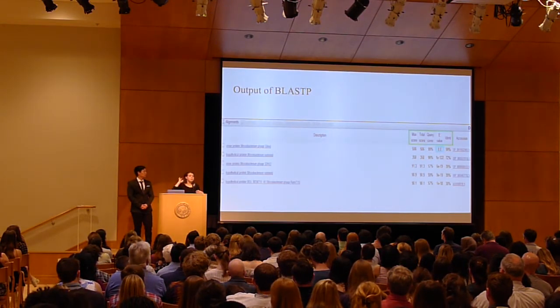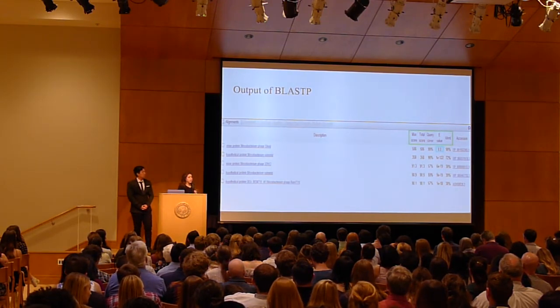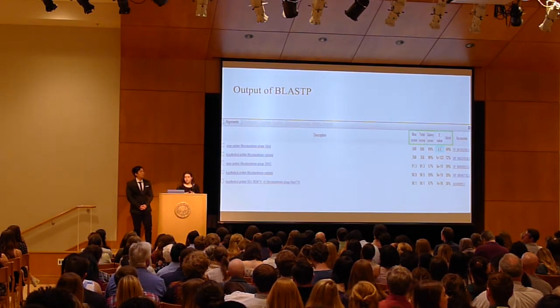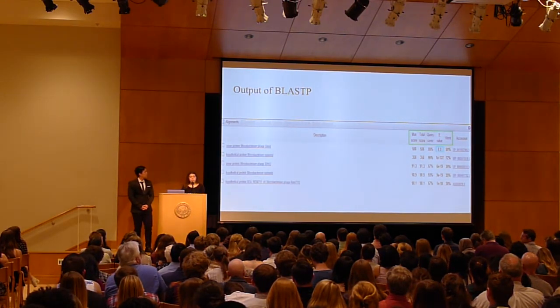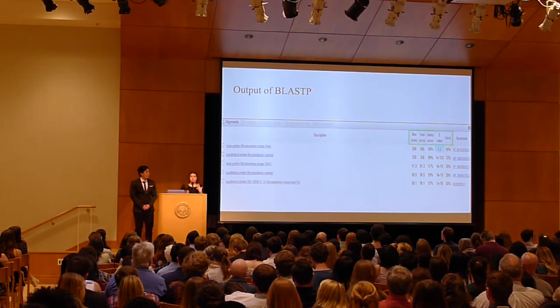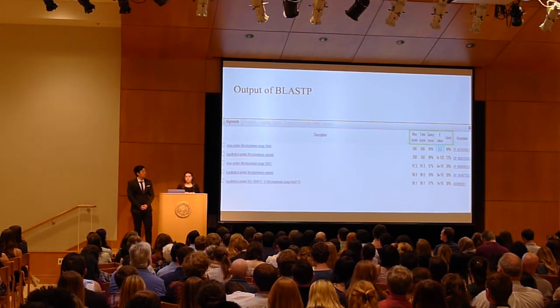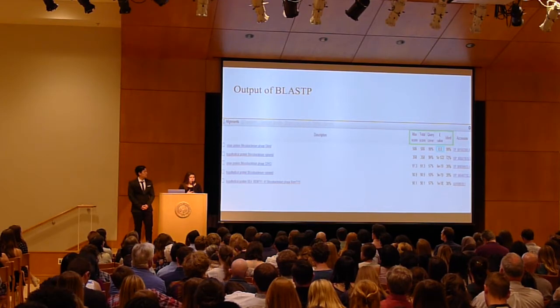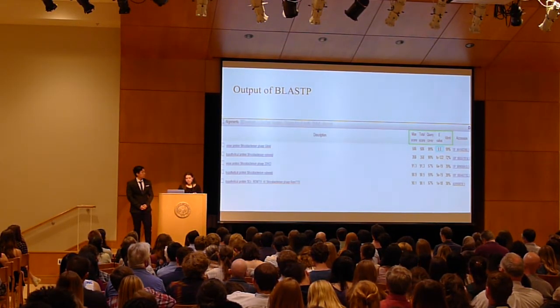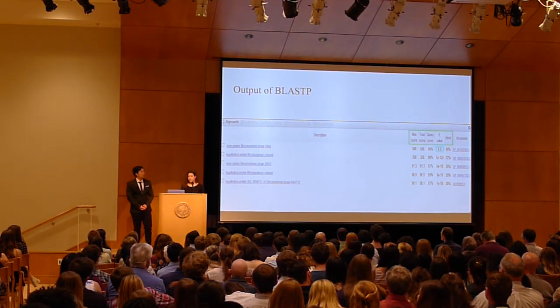This is then what we get out of BLASTp, and the biggest things that we're looking for to determine whether this is a good match or not are in the green box, the most important being query cover and e-value. The query cover is just the extent to which the possible function of the gene matches our gene of interest. The e-value is the probability that this match for a function could happen by chance. So 0.0, as we have in the blue box, is an ideal e-value score.